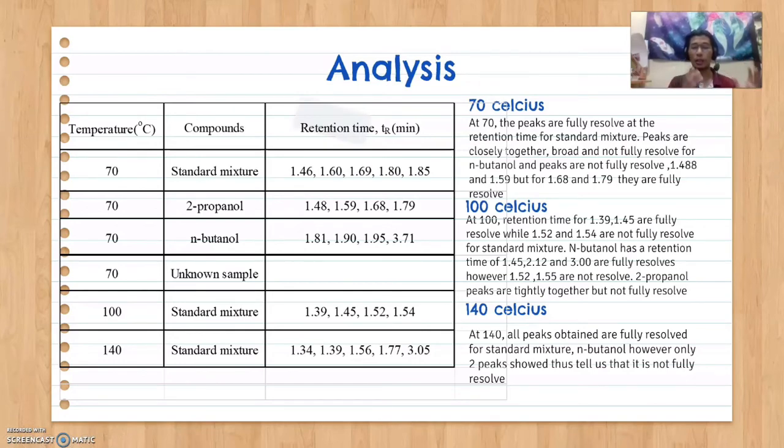Next is our analysis. The table shows the data that we collected, which is the retention time for each of these compounds at the temperature given. From my analysis at 70 degrees Celsius, the peaks for the standard mixture are fully resolved, which is very accurate at first.